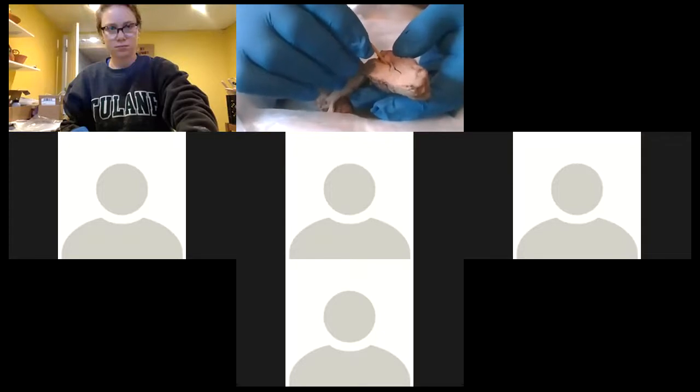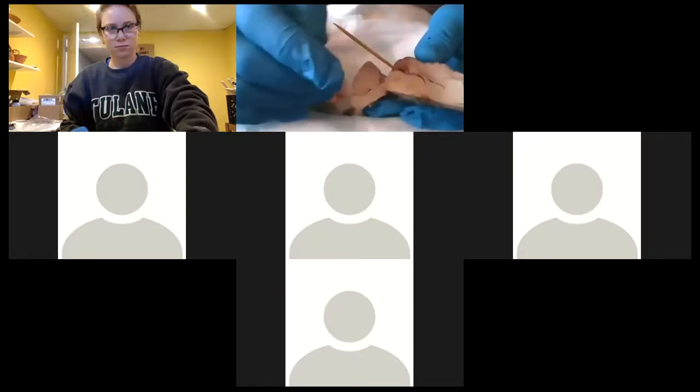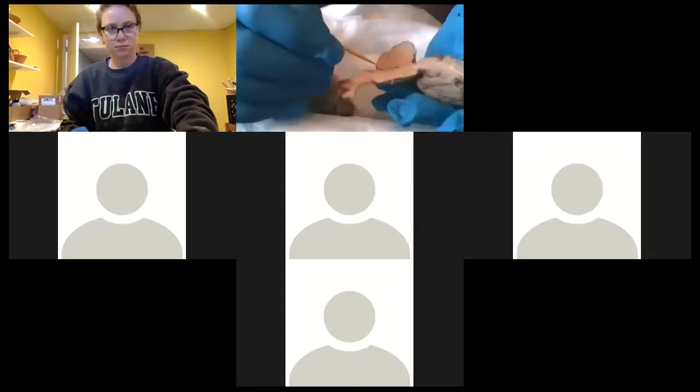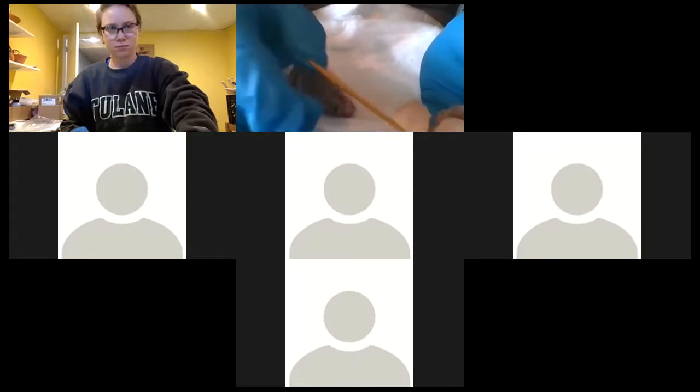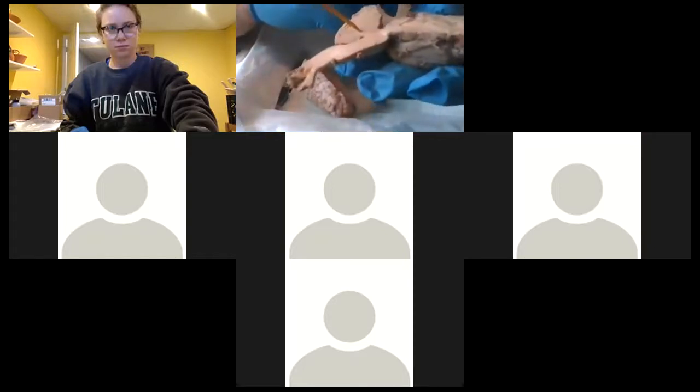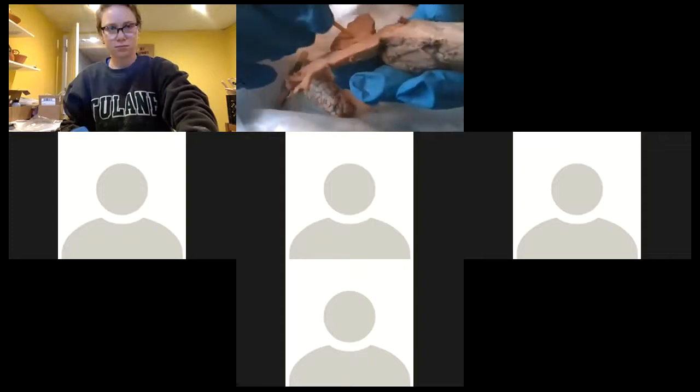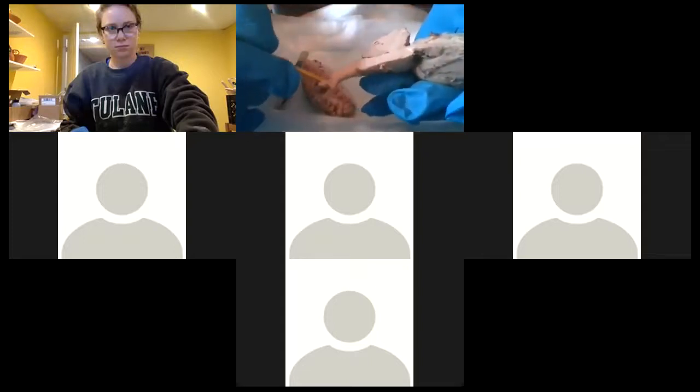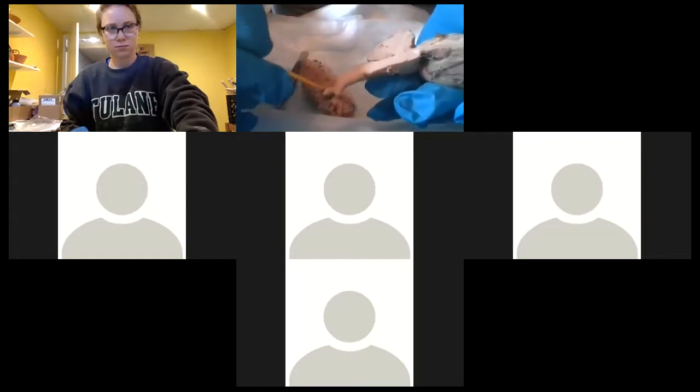And I think the book suggests, or the Carolina Biological suggests, you take pictures as you do this, because you're going to throw this away. You can hold on to this. You could package it away, keep it airtight, and you could use it later. But I don't think you really want to do that. So right here again, corpus callosum. This would be your cingulate gyrus right up here. This would be occipital lobe. And if you really look close, you should be able to see the white matter in the cerebellum called the arbor vitae. And a little bit of the central canal starting down here, going to the spinal cord.